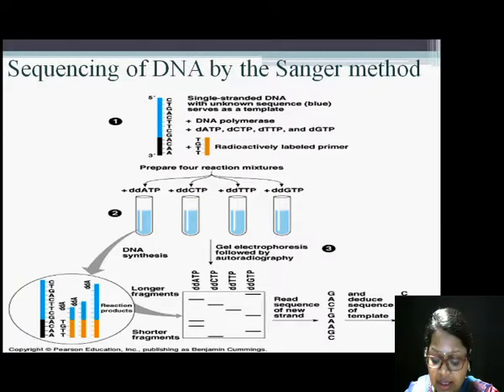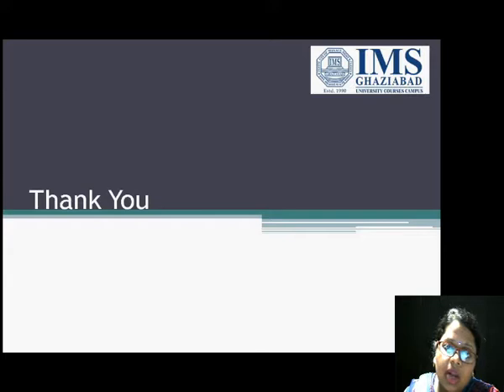So this is how Sanger sequencing is done. This was all about Sanger sequencing.